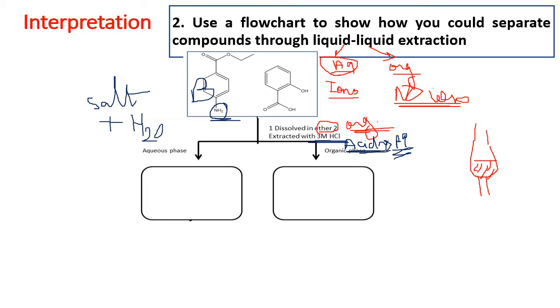What do you know about the salt? The salt is an ionizable molecule having a positive cation and a negative anion. And what does this mean? It means the formation of a salt will allow its movement to the aqueous layer. So now I will get my basic compound in the aqueous layer. However, my other compound will remain unionized within the other organic layer. So here I will have my unionized structure.